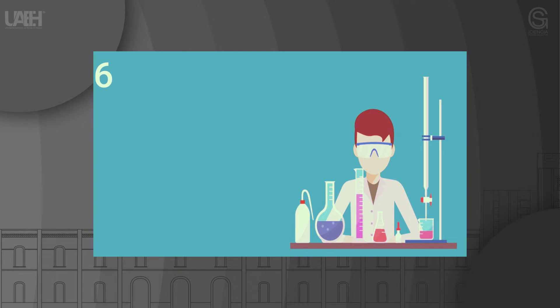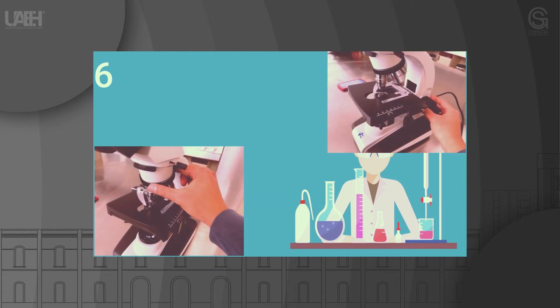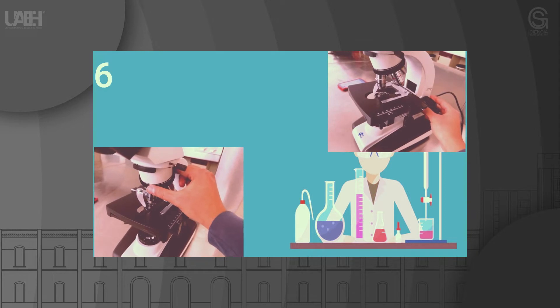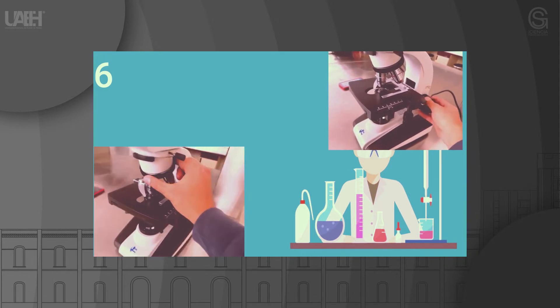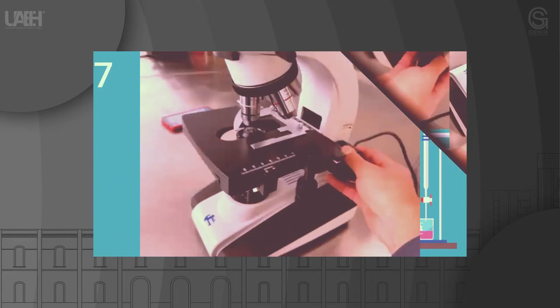Step 6: Adjust the coarse screw again to increase the distance between the sample and the objective while looking through the eyepiece. Gently move the screw until you detect the point where your sample image comes into focus.